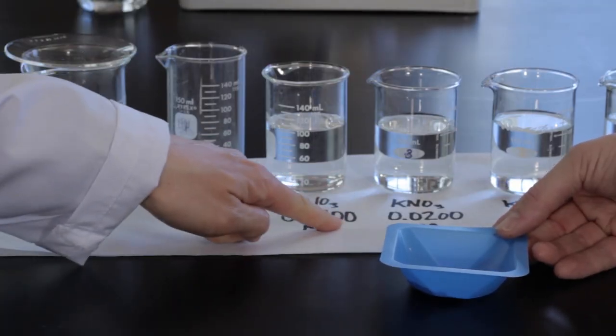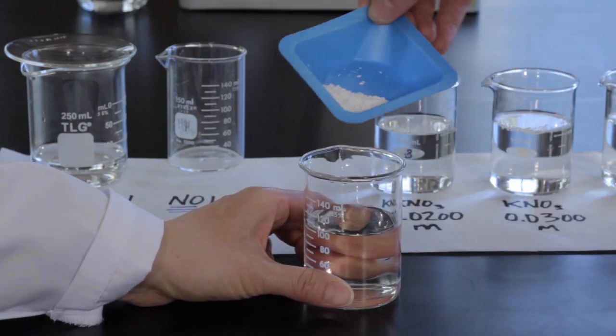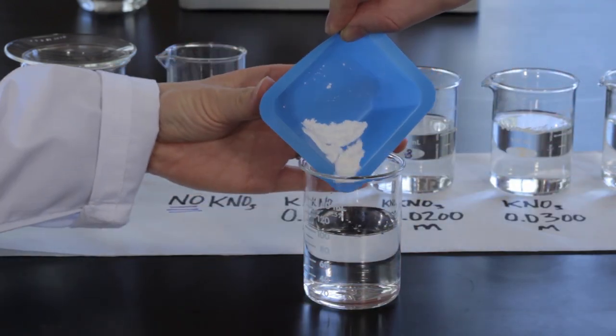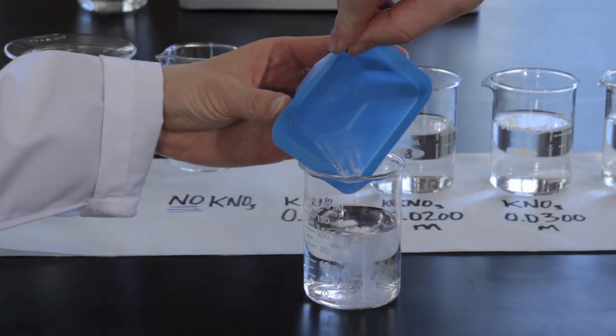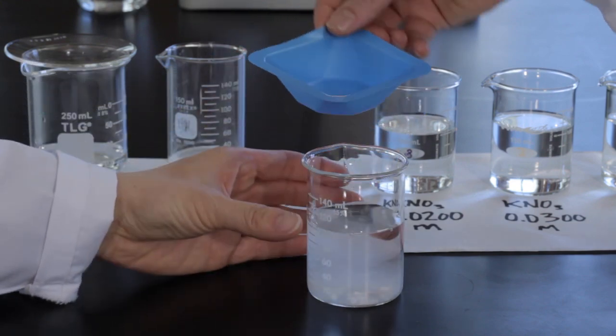Repeat the procedure, except this time approximately 100 milliliters of a potassium nitrate solution will be used as the solvent. Weigh out approximately 1 gram of potassium hydrogen tartrate and transfer the solid into a clean, dry beaker.